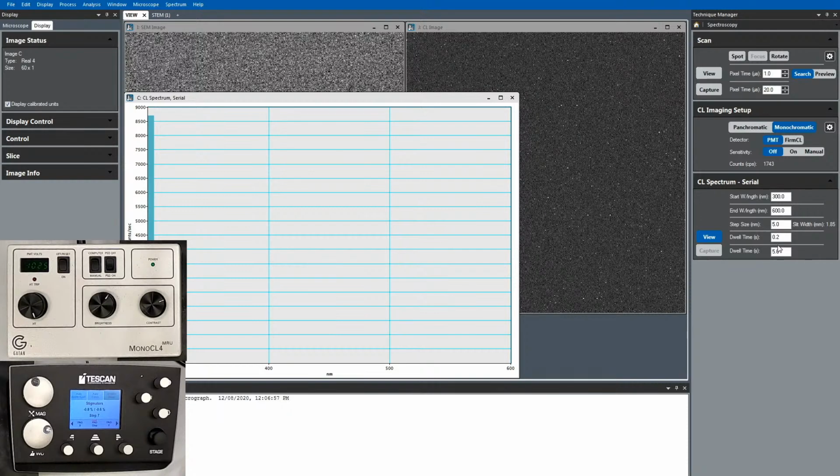So we've got 200 microseconds or milliseconds. I think for the purpose of expediency, I'm going to stop this. And let's see if I can just do a quicker one.